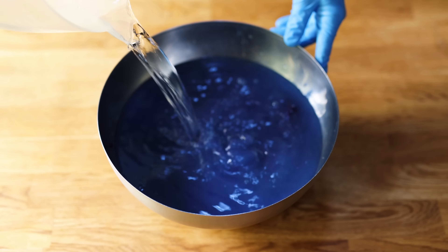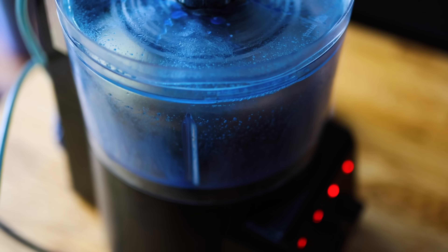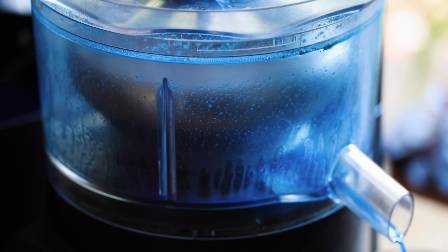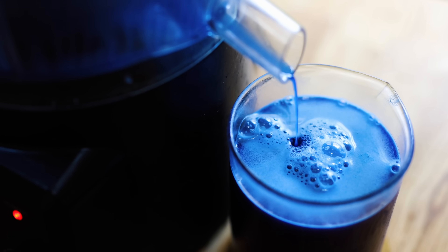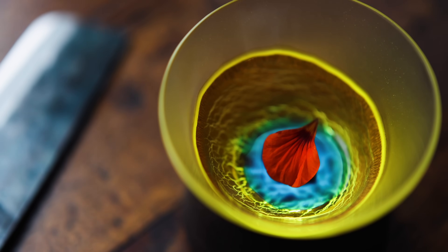There's a distilled osmanthus flower hydrosol that I use, for example, to add aroma to a blue algae miso sauce for one of the dishes on the tasting menu. It's a complex dish, but this is the perfect way to add that beautiful floral aroma to it. It's a very powerful technique that gives you the ability to add flavors in new ways into food and drinks, and even things as simple as cold brewed dashes can really benefit from this.